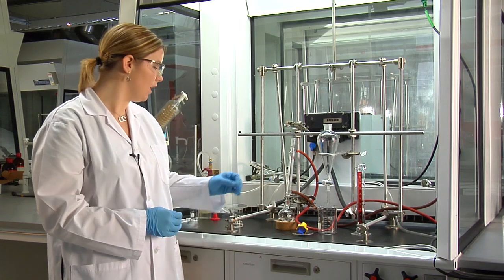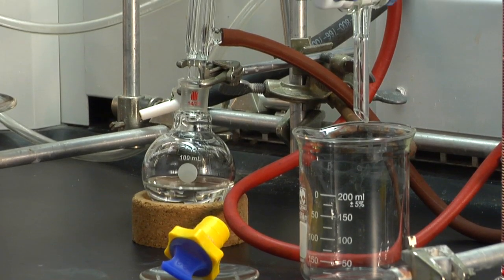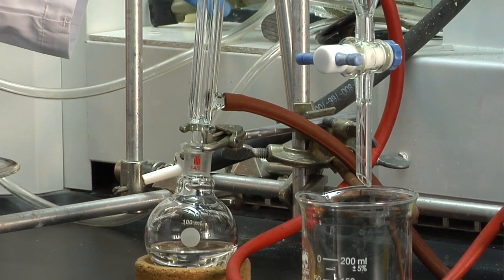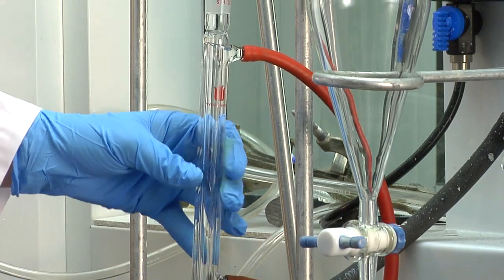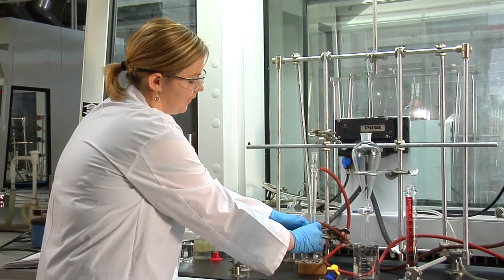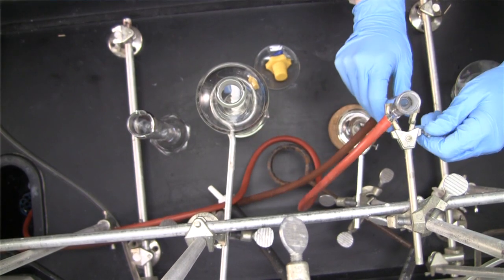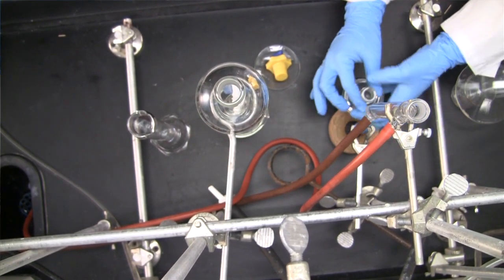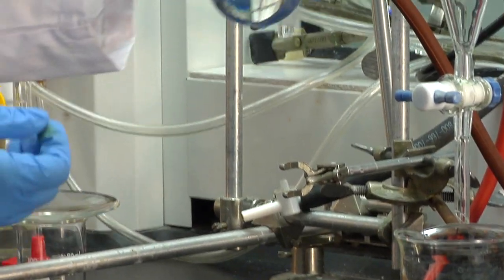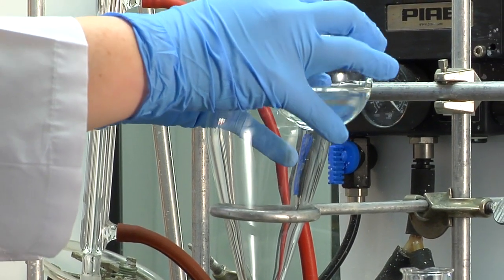I'll just get you started off here. We have our solution with the condenser still on it, so as it's cooling down to room temperature, make sure your condenser is still on the top. But we can remove it now that it's cooled down. I'm just going to take this off and put it up here. And now what we're going to do is take our solution and transfer it into a 250 ml separation funnel.